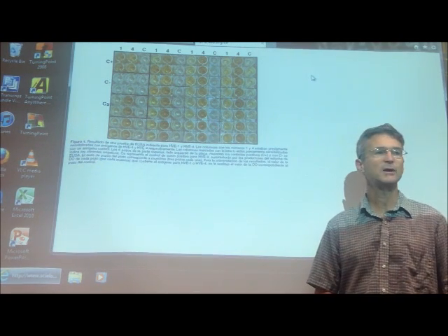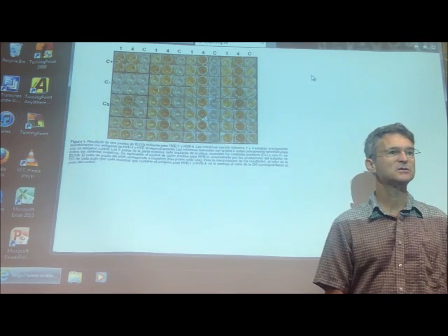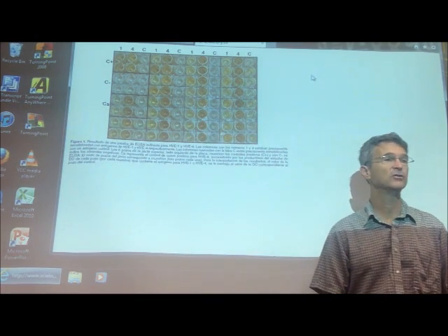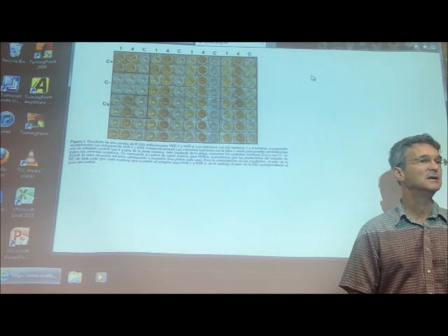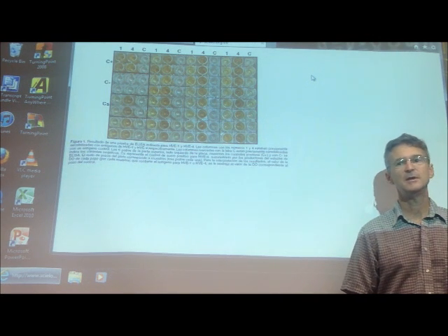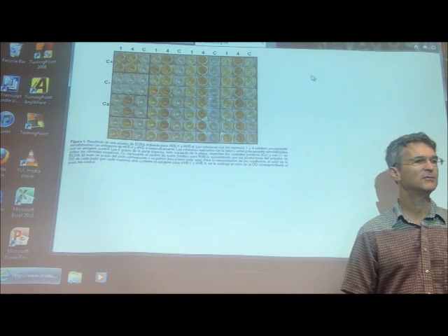And of course you have a plate reader. You pop the thing in, and you can tell it where the controls are, and then you give it a standard curve, so you usually run a standard curve on this as well, and then that'll automatically tell you how much protein you've got in each well. You input the values for the standard curve, for exactly how many milligrams per mil you have of your particular protein in your standard curve.